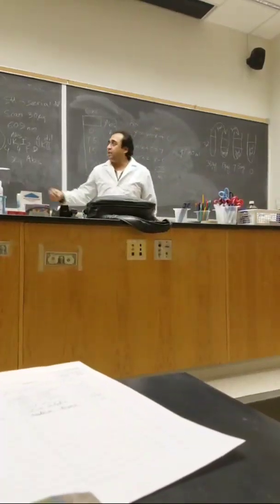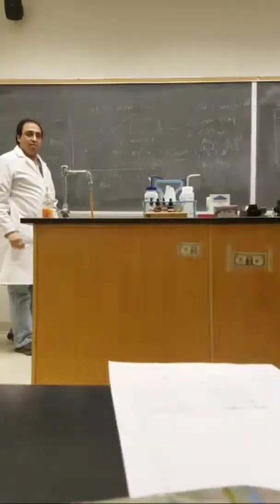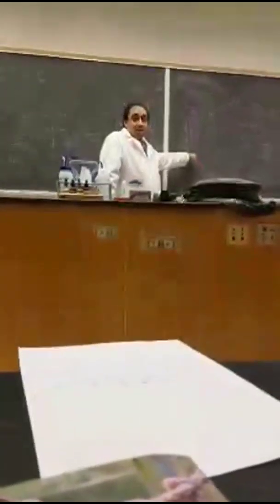You can use this one like 1 unit, 1.5 unit, 0.25 unit, because we don't know the milligram or gram there. But here we know that this is microgram per ml. So whatever the concentration of the unknown solution of methylene blue, that should have the unit microgram per ml.